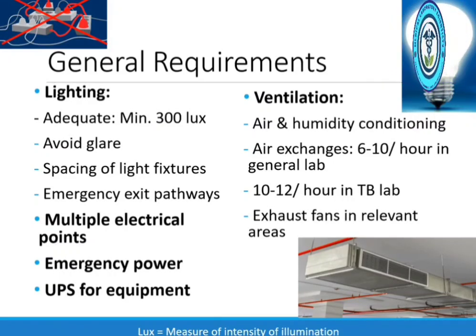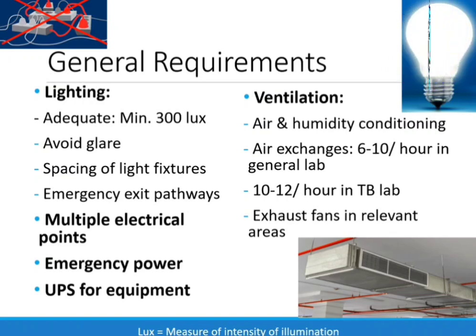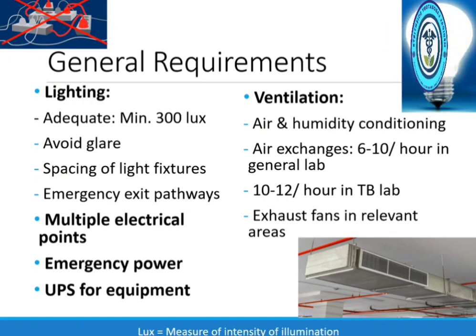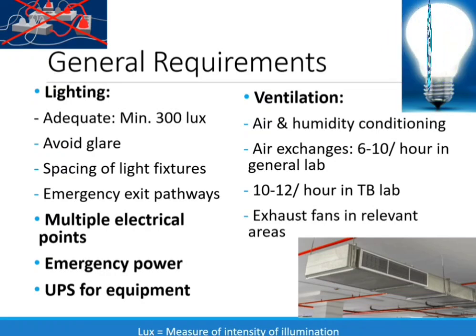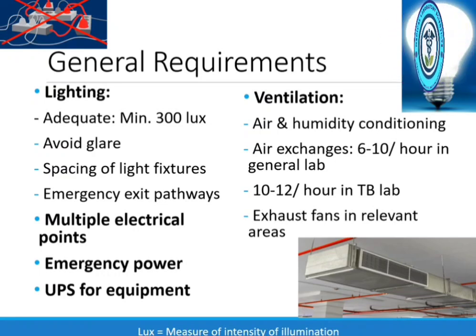Lighting. A laboratory must have a minimum lighting of 300 lux, where lux is a measure of intensity of illumination. The lights should not produce a glare on the workbench. There must be appropriate spacing between the light fixtures. And the emergency exit pathways must also be lit adequately.